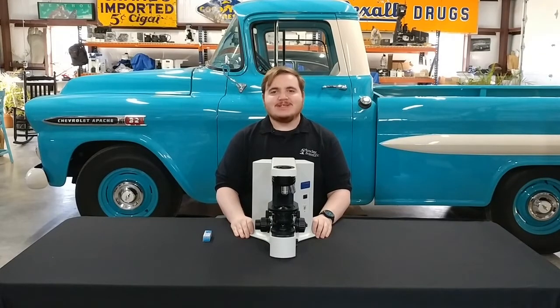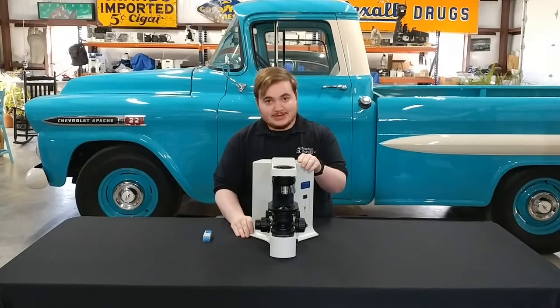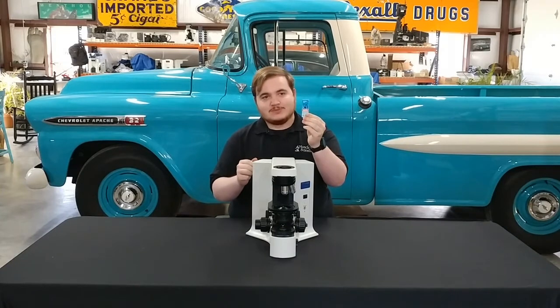Hello everyone, this is Walker Kelly with Monday Scientific Instrument Service, and today we're going to be showing you how to replace the light bulb on a VX41 microscope. For this, you're going to need your VX41, as well as your 6-volt 30-watt replacement bulb.